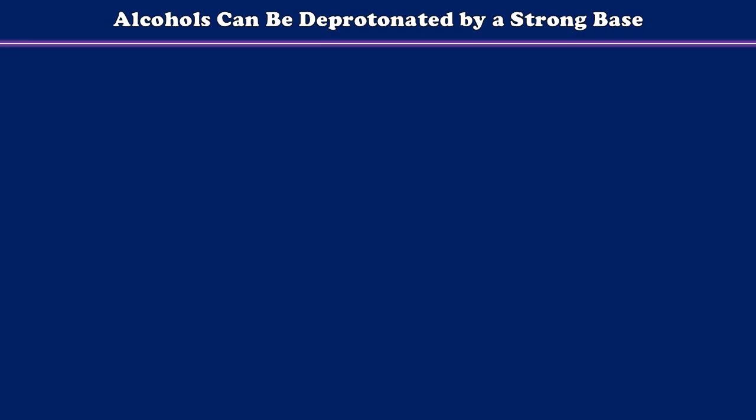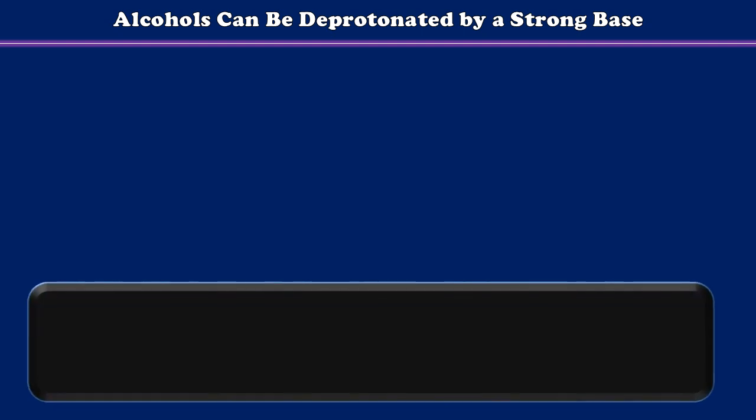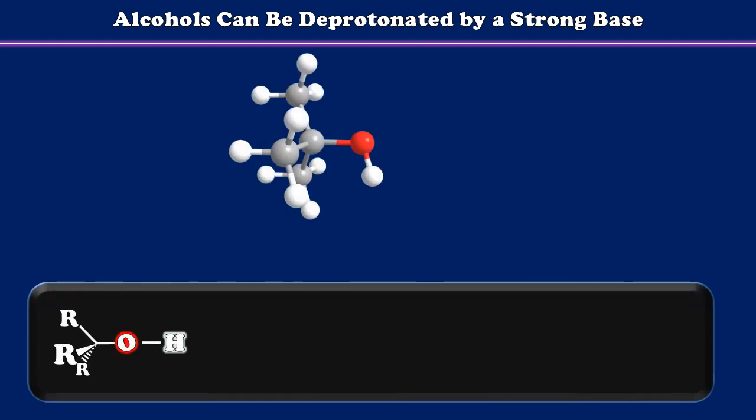This week we'll be using a reaction that involves the deprotonation of an alcohol to initiate a substitution reaction. Now, alcohols can be a little bit tough to deprotonate sometimes, depending on exactly what type of alcohol we're using. So consider just a typical aliphatic alcohol like t-butanol. This can be deprotonated by a sufficiently strong base, but what's sufficiently strong here?